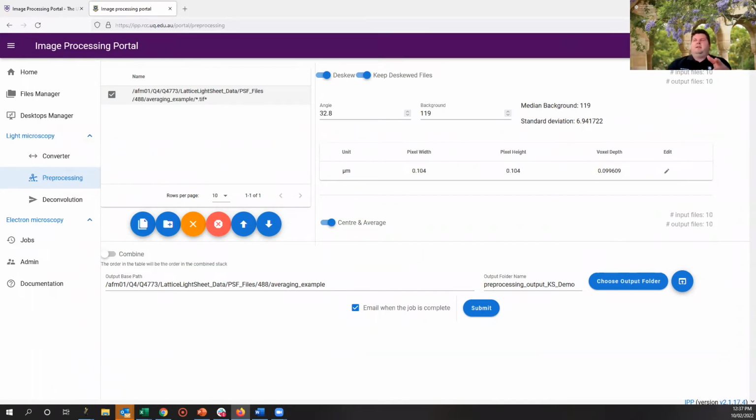So I agree with what Niall's saying, where you may want to look at a single frame now, but I also think that you want to process it to actually understand the data, because going from non-deconvolved to deconvolved really clears up, and you get that clarity in what's actually happening. So it's kind of like judging whether the data is good or not, where it's kind of foggy and not as sharp.